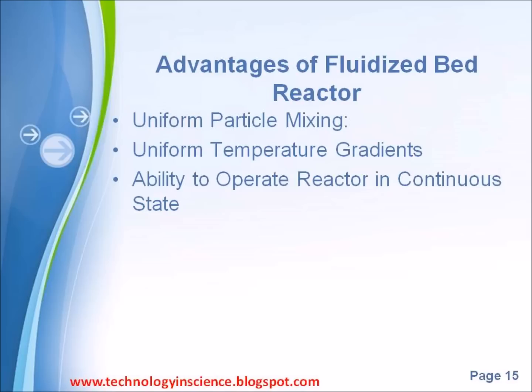Uniform temperature gradients. Many chemical reactions require the addition or removal of heat. Local hot or cold spots within the reaction bed, often a problem in packed beds, are avoided in a fluidized situation such as in a fluidized bed reactor. In other reactor types, these local temperature differences, especially hot spots, can result in product degradation. Thus, fluid bed reactors are well suited to exothermic reactions. Researchers have also learned that the bed-to-surface heat transfer coefficients for fluidized bed reactors are high.